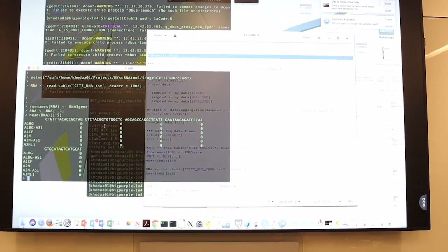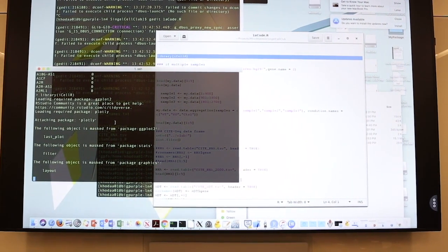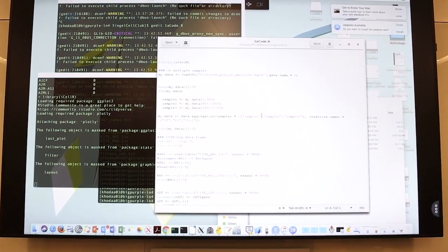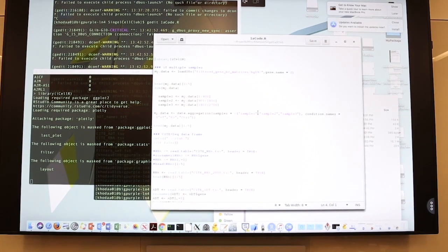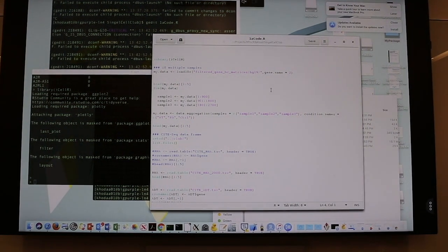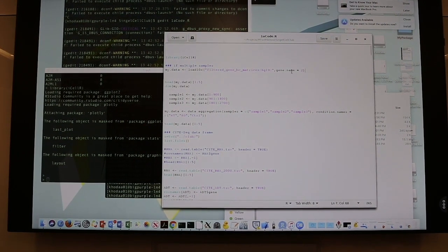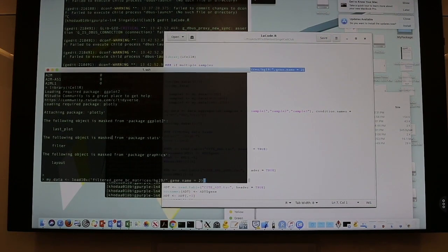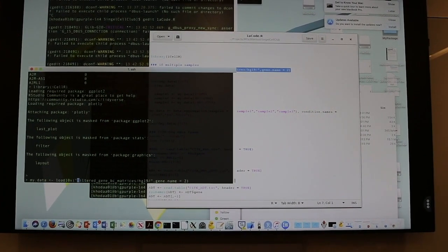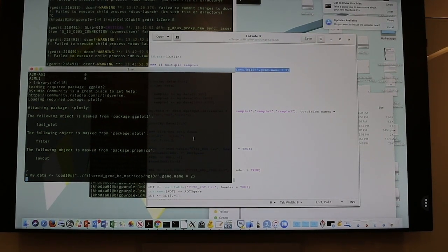So after installing iCellR, if you're familiar with R, you can load the package, and once it's loaded, you can go to the directory where your files are. It's taking a little bit of time. So if you have a sequence with 10x Genomics, there's a function called load10x, and then you can just direct it to the files. If you know where the files are, you can just use this function to read the data. It can read zipped or unzipped files, and it works just like this.